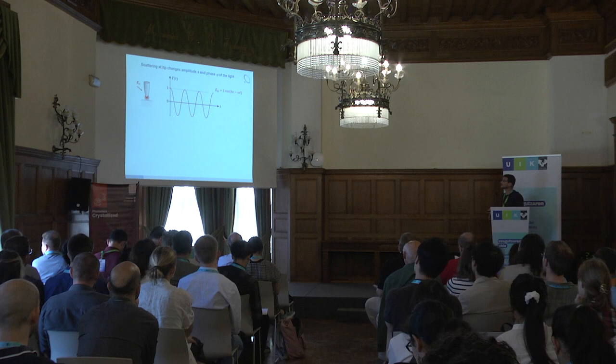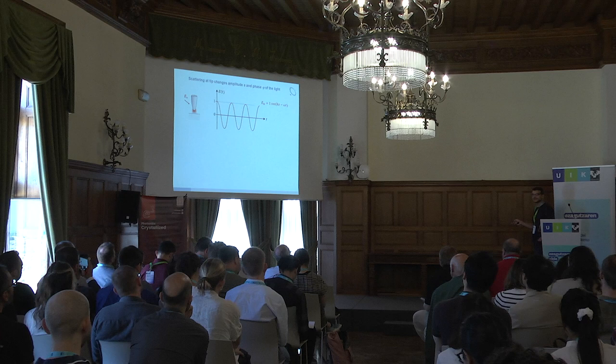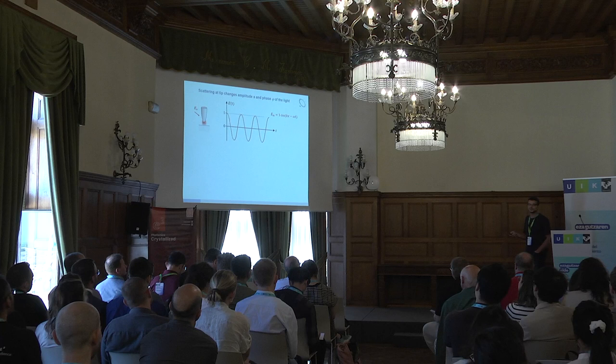And I start here from the very, very basics because I discussed with various people and they recommended me to start from the very basics, talking about amplitude and phase. Because in optics or in optical spectroscopy and imaging, measuring phases is not necessarily what people do. So typically intensity is recorded. So that's why I started from the basics.